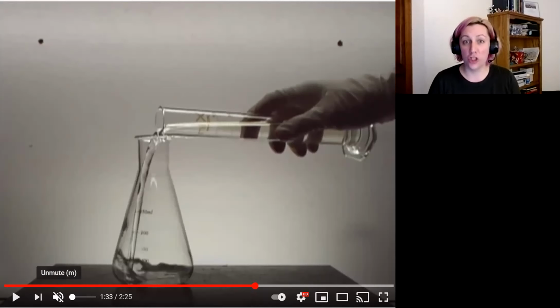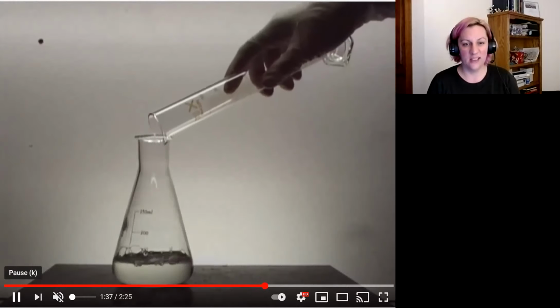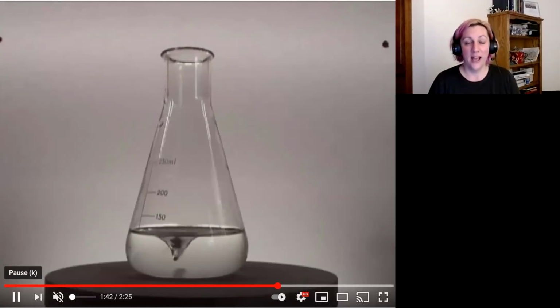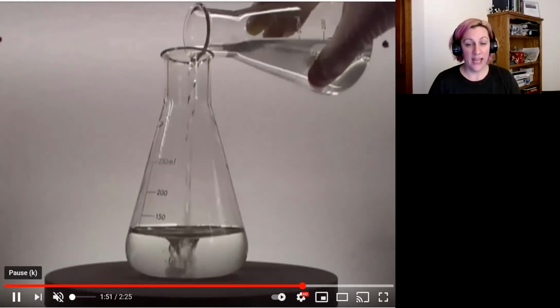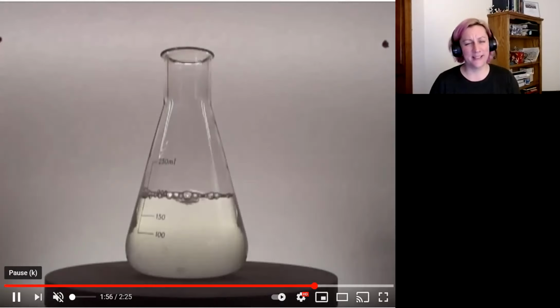And so I wanted to show you what it looks like first and talk through the chemical reaction that takes place. So first, I'm going to just show it. The cool thing about the iodine clock reaction is you mix together a whole bunch of clear liquids and you watch it and it stirs for a while and it's just clear and it's clear and it's clear. And then suddenly, it starts to produce enough iodine, which is just any amount, that will react with a little bit of starch that's in the solution, and it will turn this bright blue. And sometimes it's more of a brown blue, but hopefully it's this nice bright indigo blue.